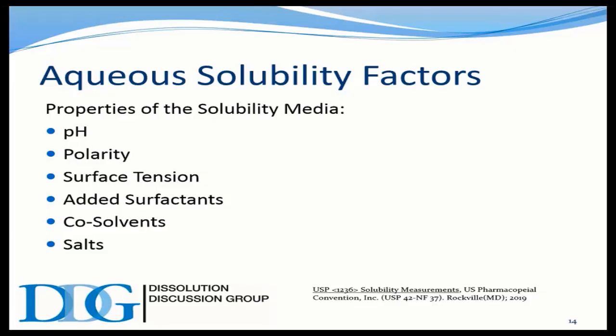No, but that's a great point. I'm glad you. And also molarity. The molarity can affect the solubility. At times, people can vary the molarity of a media to increase or decrease the solubility. No, that's true. That's very true.